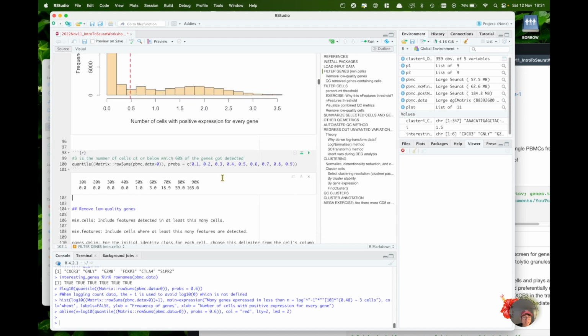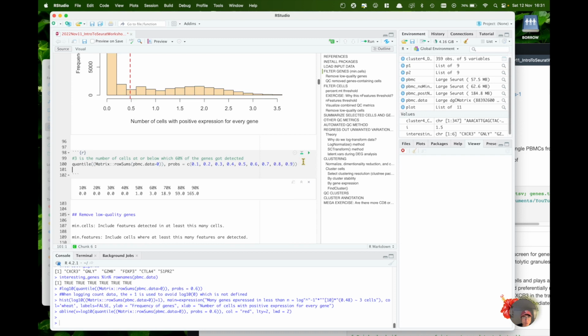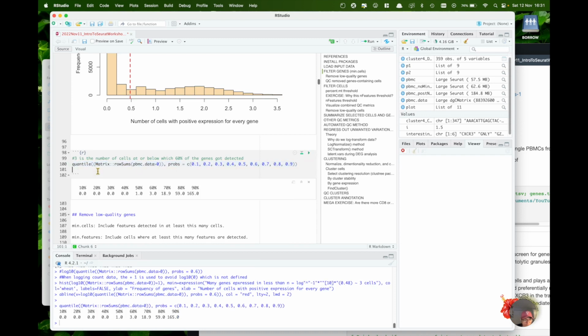One of the ways that I like to do it, if you want to be more statistically sound, is to compute the quantile values with this particular code. Say your experiment contains multiple donors and multiple samples and you want to keep the QC metric consistent. This applies when your experiment only involves the same cell type.